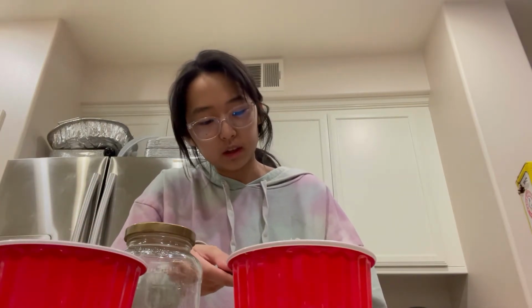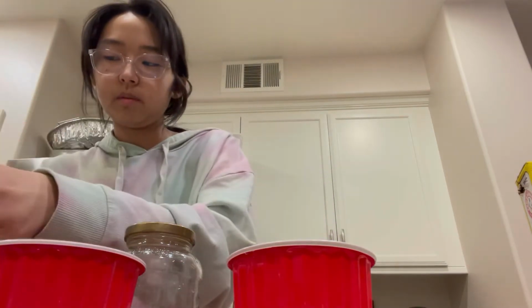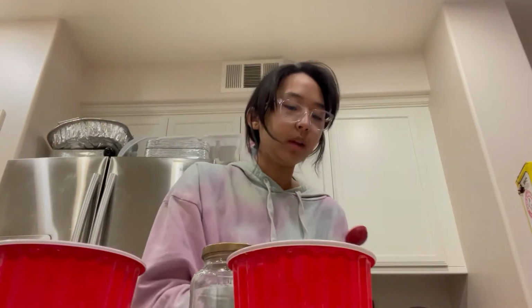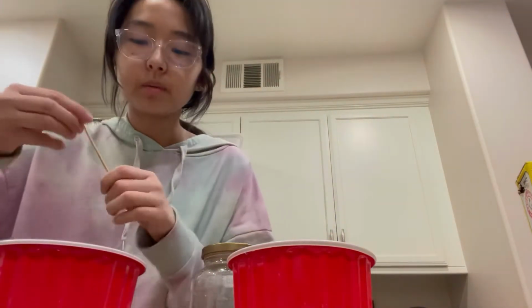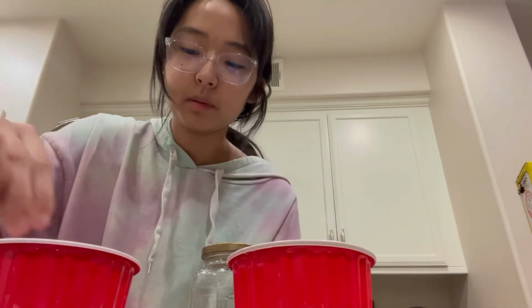I'm actually combining the 2, and I'm going to be combining them in this clear jar so we can see the precipitate form. So yeah, I'm just going to mix both of them up, and I will come back when the precipitate has formed.